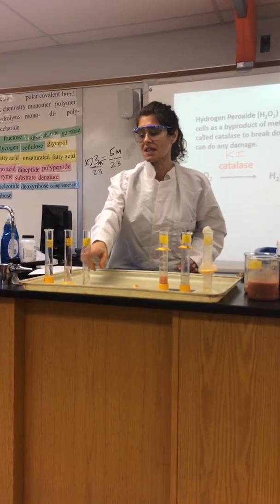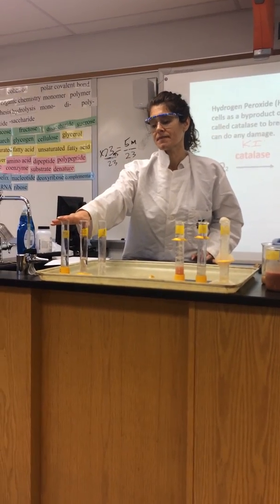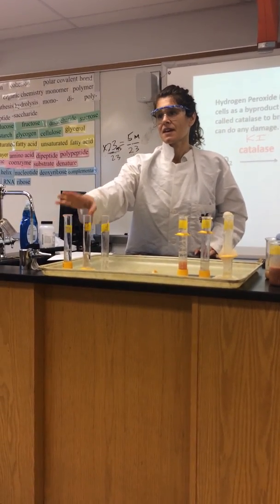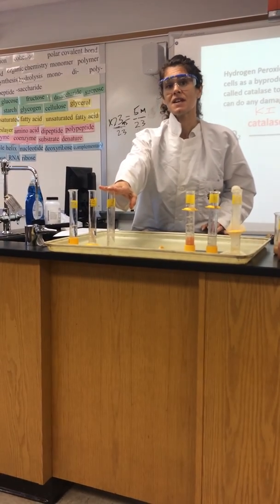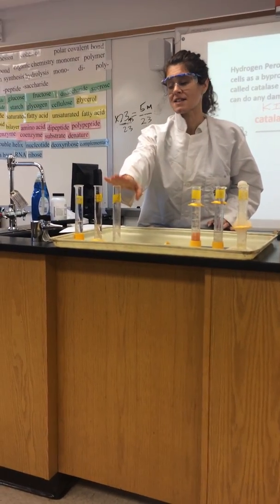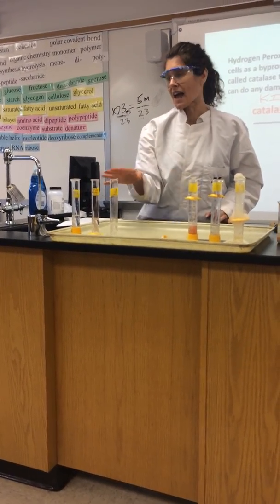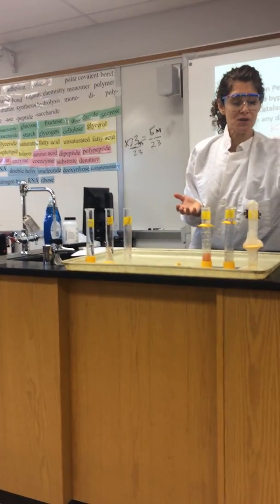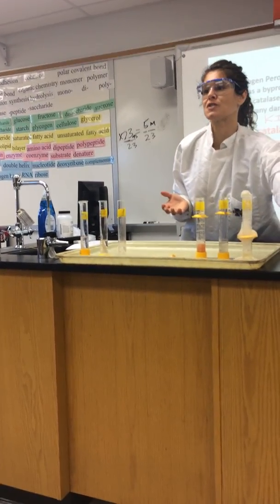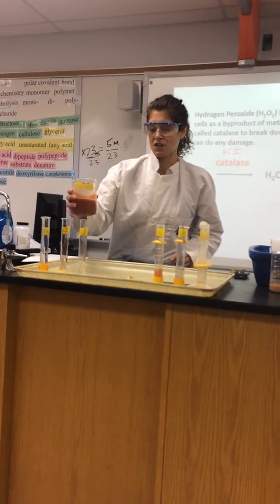Now we're going to move on to the next set of experiments, which is the pH differences. So in D, E, and F — F is neutral, D has acid, and E has a base, and also some hydrogen peroxide. For this one, I'm going to use fresh liver for all of them, so the only variable is the pH and temperature is not an issue.